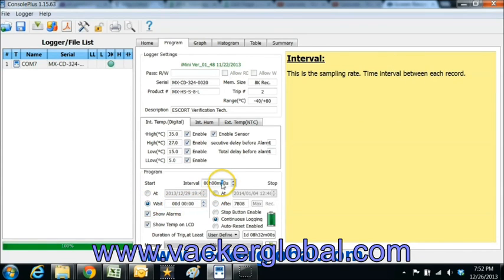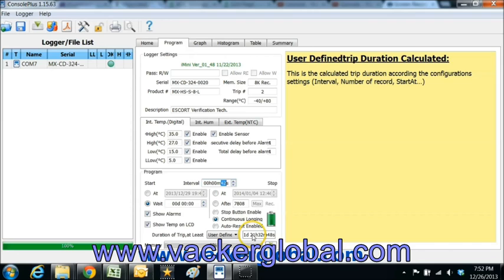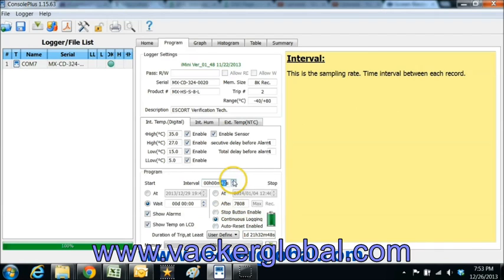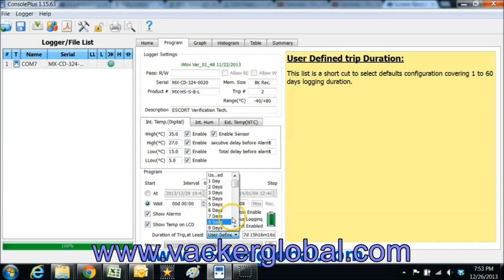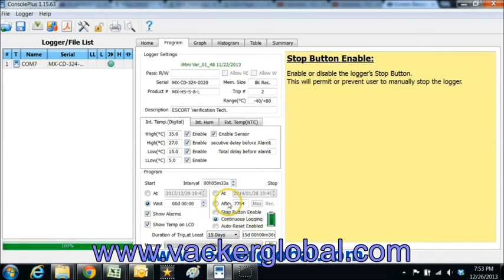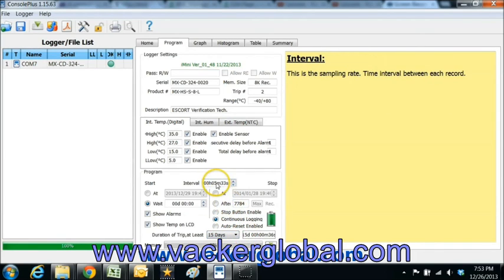Here you can change the sampling interval in seconds, minutes or hours. Accordingly you can see that the total recording duration automatically changes. Also you can define the total duration of recording required by you and the sampling interval changes automatically.